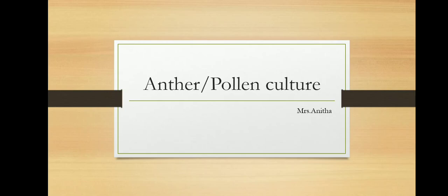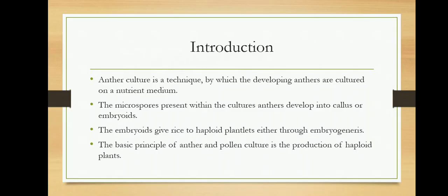Hello all. In this video, I'm going to explain about the anther or pollen culture. And coming to the introduction of anther or pollen culture, here the anther culture means culturing of anthers in vitro conditions on a suitable nutrient medium is called as anther or pollen culture.